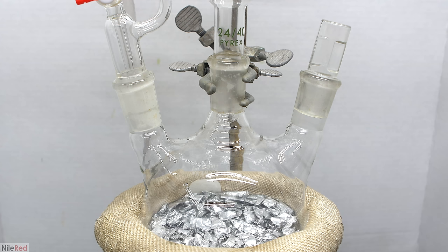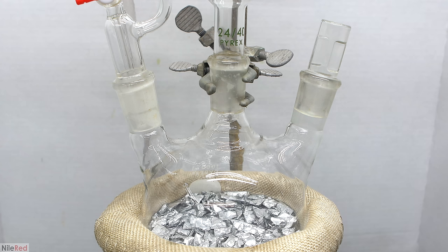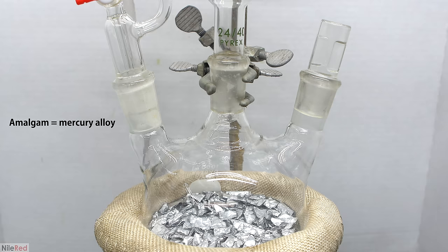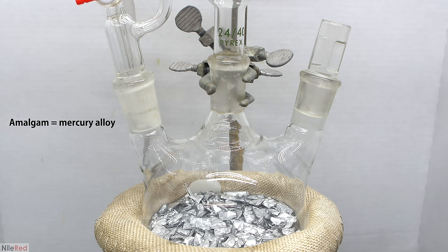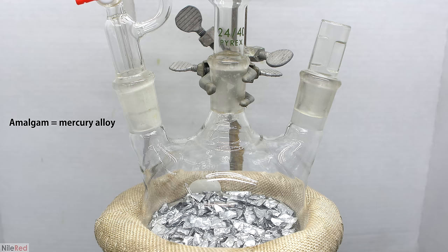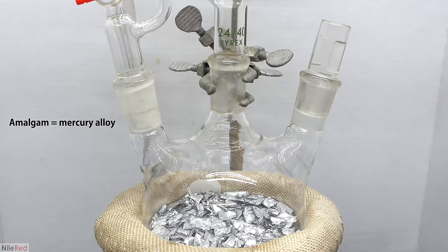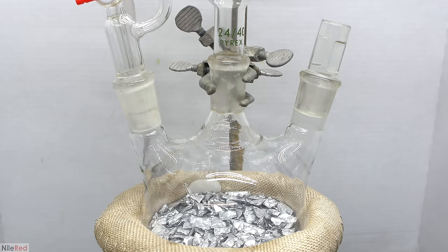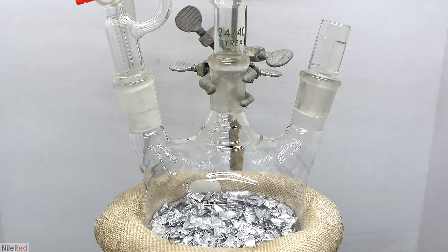To get through it, we use a combination of mercuric chloride and iodine. Mercuric chloride is a salt of mercury, and when it comes into contact with aluminum, it forms an amalgam. The formation of the amalgam disrupts the oxide layer and leads to exposure of fresh reactive aluminum metal. Without the oxide layer to block things, the aluminum can react with the isopropyl alcohol and form our aluminum isopropoxide.